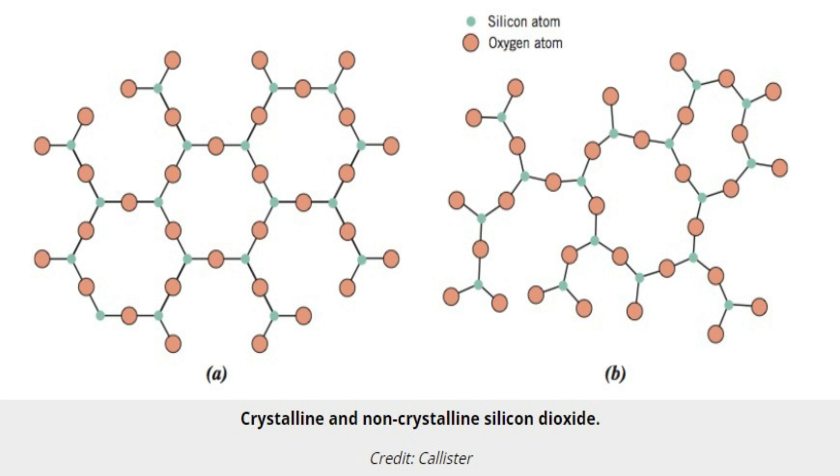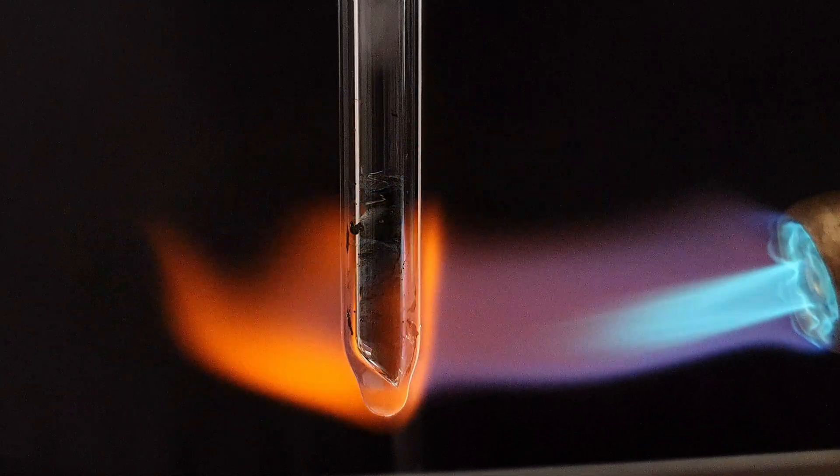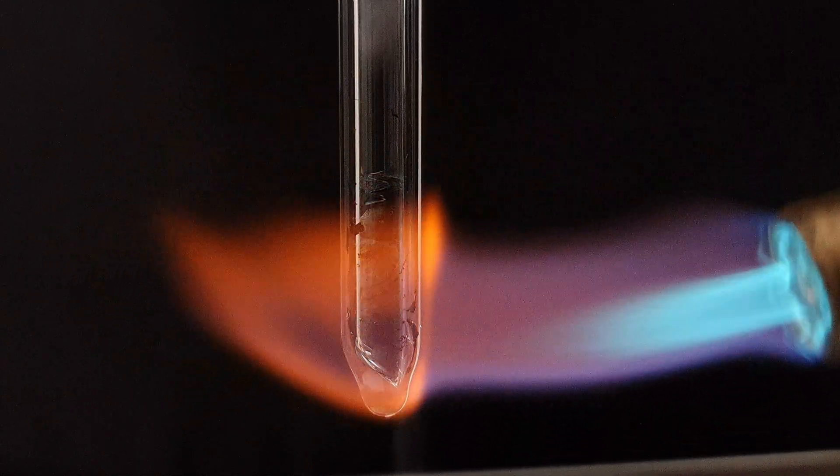Lithium, however, rips the oxygen out of the silicon dioxide and forms lithium oxide. This reaction causes massive damage to the structural integrity of the glass.